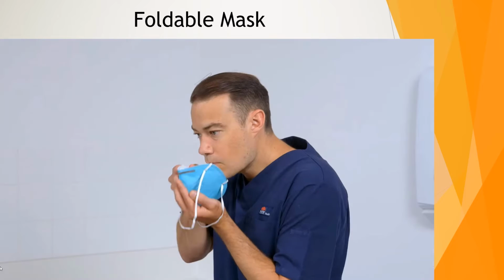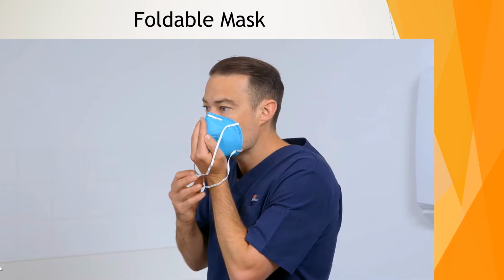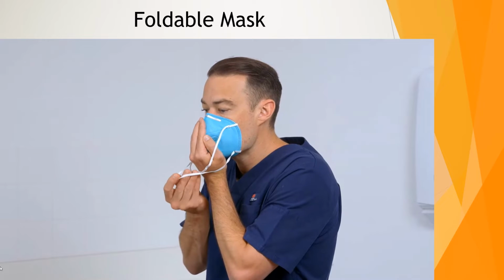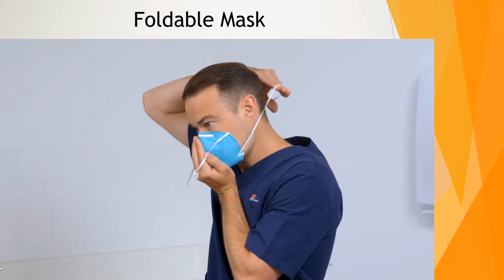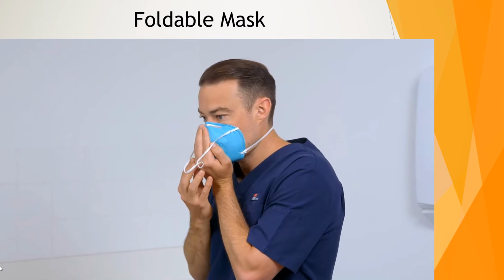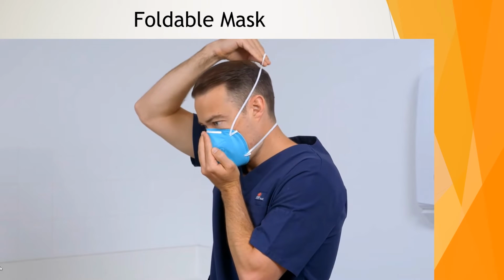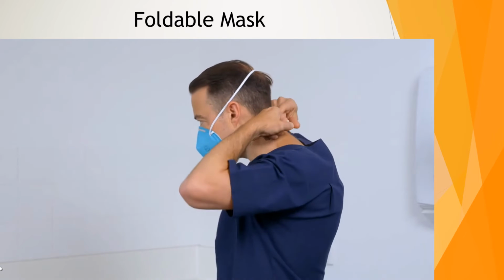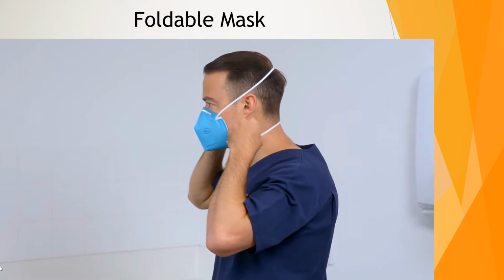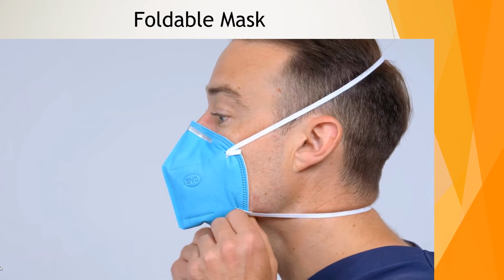Place the respirator against your face. Position the respirator under the chin with the nose piece across the bridge of your nose and mouth. Keeping one hand on the respirator, pull the bottom strap over your head, then position it around the back of your neck and below your ears. Pull the top strap over the top of your head and rest it high on the crown of your head. The straps must not be twisted. Adjust the straps. Then adjust the respirator at the chin and cheeks.